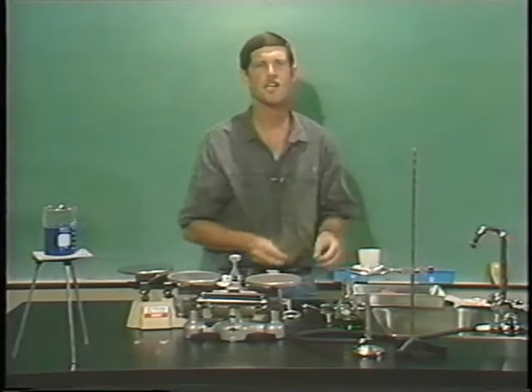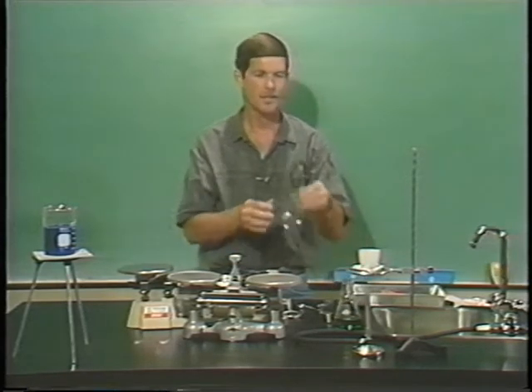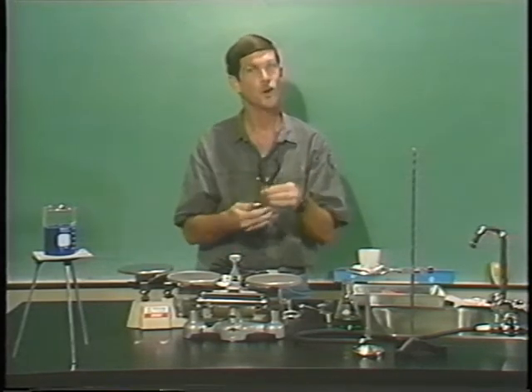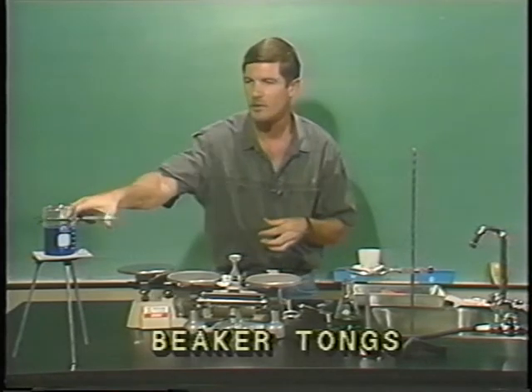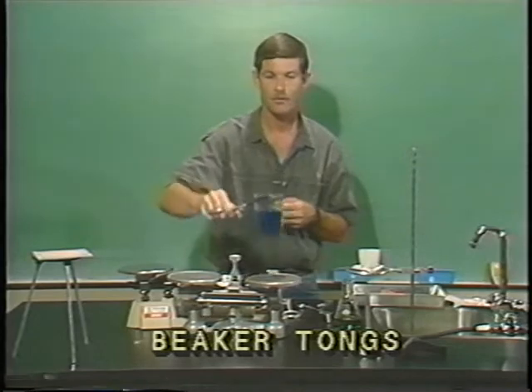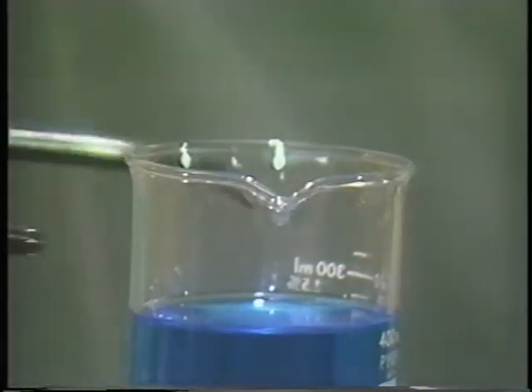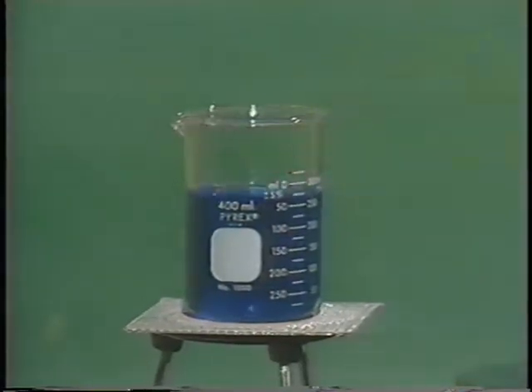Then we have special types of tools that we pick up our glassware with. These, as you might guess, are for beakers. They're called beaker tongs, and we will use them to pick up a beaker. They're not used for anything else, and in fact, you wouldn't want to try and pick up a beaker like this with them. It just doesn't work. Beakers always get picked up like this with the beaker tongs.